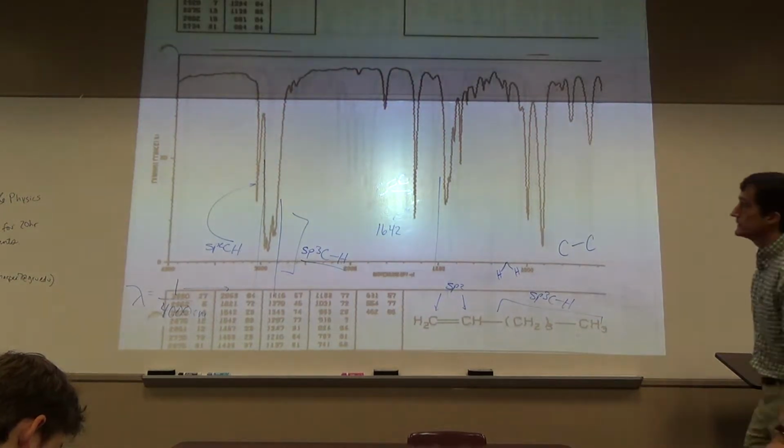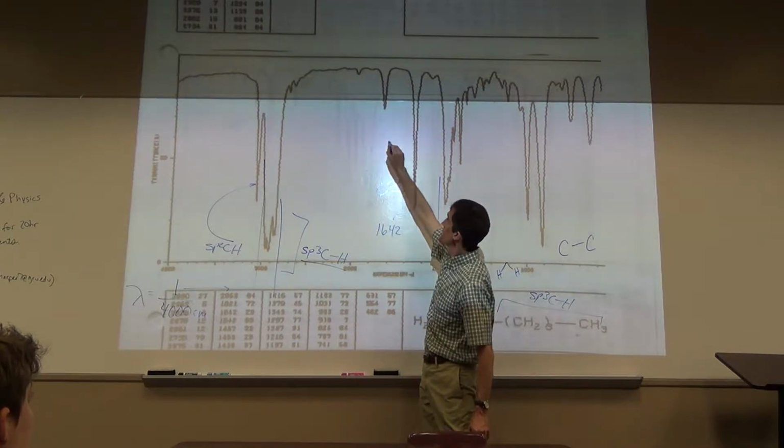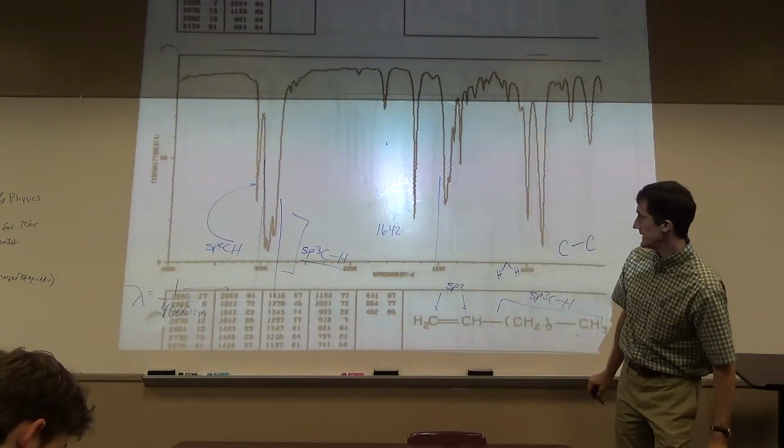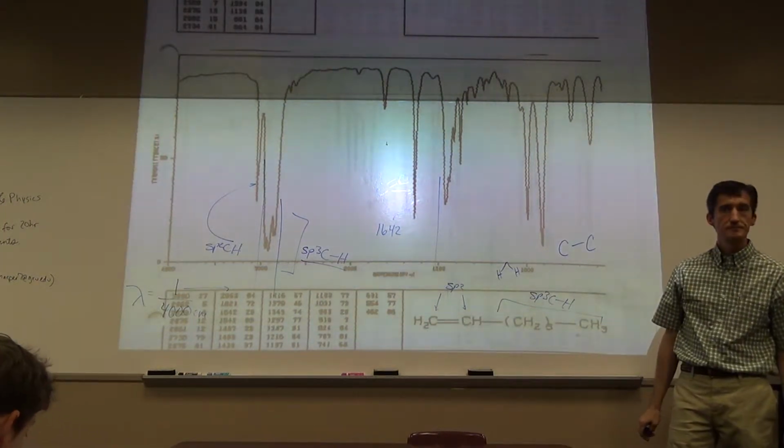What is this peak here? Anybody? What is that, about 1800? What is that peak?